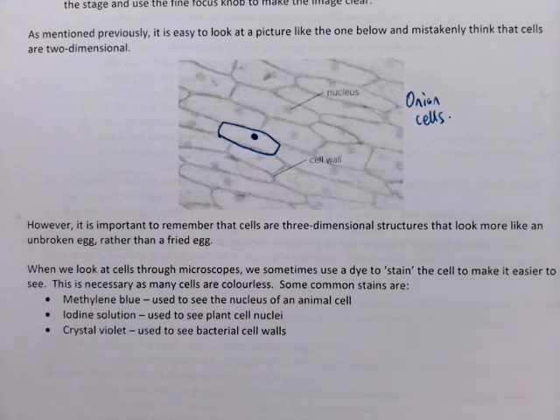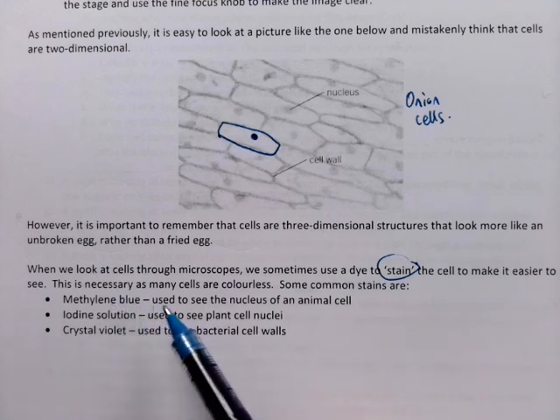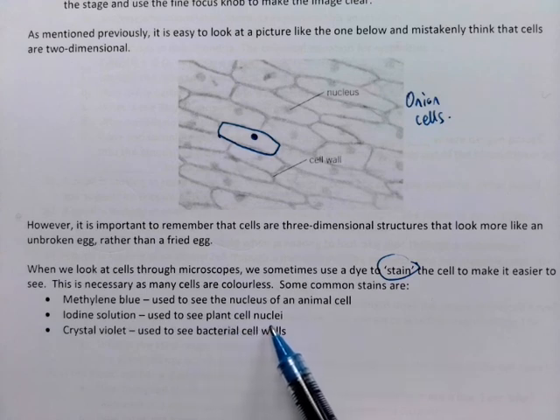Which means that we need to stain cells. In other words, we need to add a bit of color to them so that we can actually see them. So these three stains are common stains. If you add methylene blue, you'll be able to see the nucleus of an animal cell. That will highlight that. Iodine solution can be used to see plant cell nuclei, and crystal violet can be used to see bacterial cell walls. So depending on what kind of feature, what kind of subcellular structure you want to pick out, will determine which kind of stain you want to use.